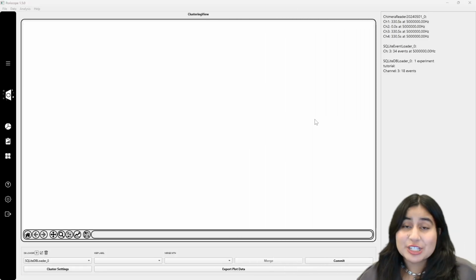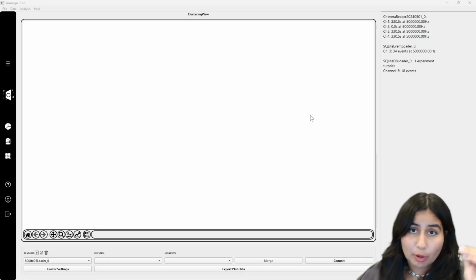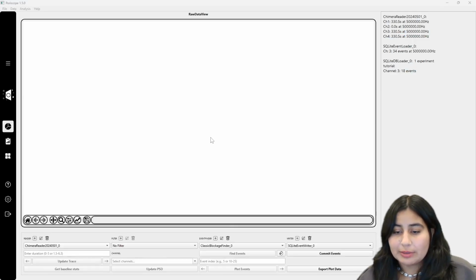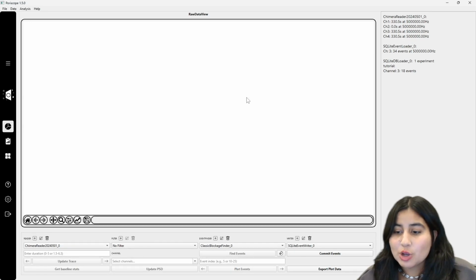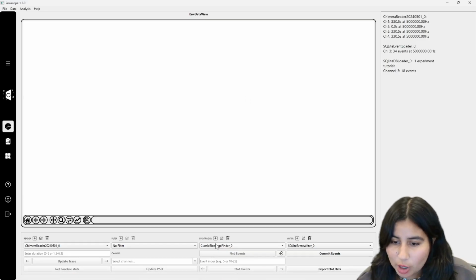Before we move on, there is something I want to touch base on, and to do that, I have loaded the part 2 session, so you can double check here. It's everything we did. And it is the fact that, as you're aware, objects in Poriscope are extremely interdependent. What do I mean by this? As you're aware, if you add an event finder, it's going to ask you which reader you want this event finder to be locked to, and so on with writers. And so far, we have seen the add option. We have also seen the edit option. The only option that we're missing is the delete one.